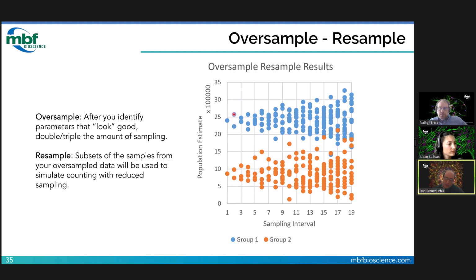So it looks at just the odd sites that you're using, and it needs to extrapolate that out twice as much. And then it looks at the even sites. This could be sites or sections, and it gives you 2 estimates for that downsampled data. So in other words, if we did half the work, we used half the number of sites, that shows the 2 estimates we would get from the data.